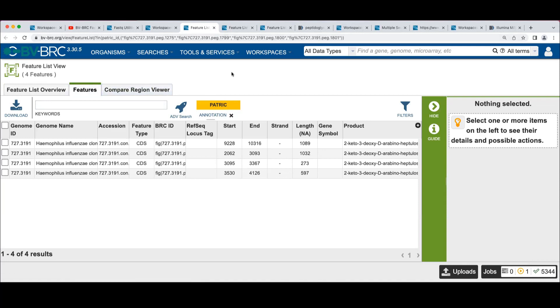How are you getting to the comparison from the table? When you click on the four features, it takes... I'll do this again. It takes you first to the list of features and then you can click on the compare region tab.